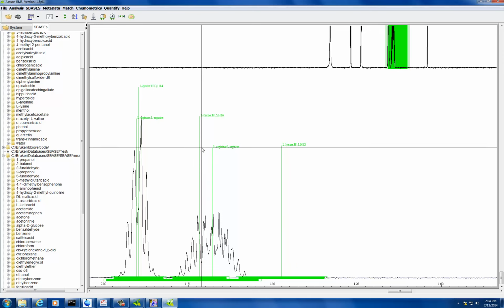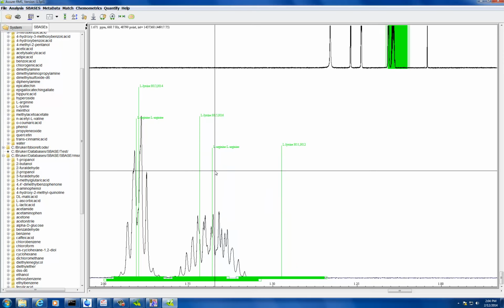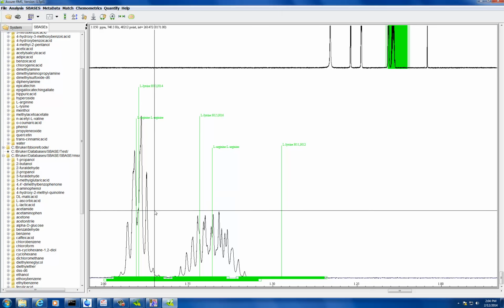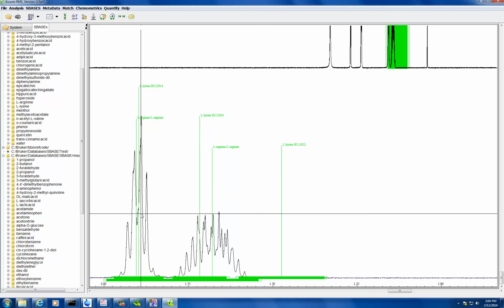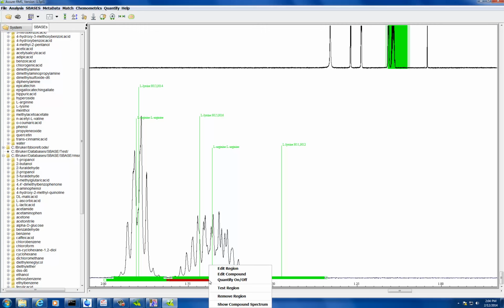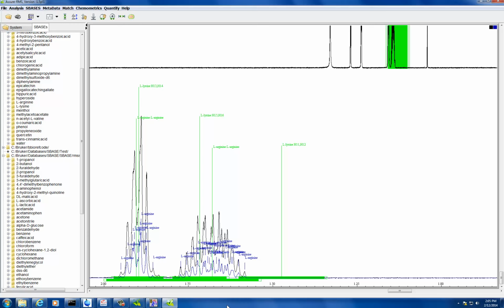As well, when you pull in the compounds from the S space, here I'll give it back to you. If you go in that specific region, like go to one of those tabs, and then right click, you can go show compound spectrum. So if you click on that, the blue comes up. You see the blue?